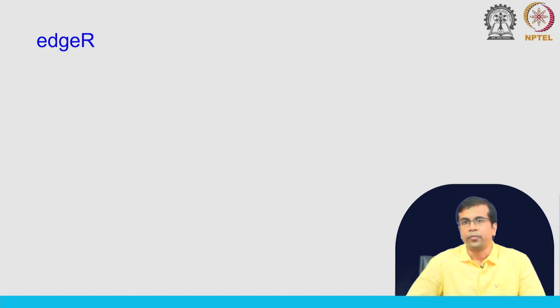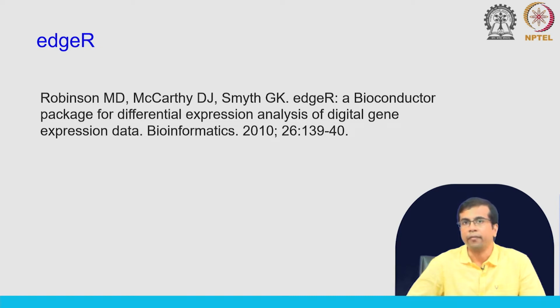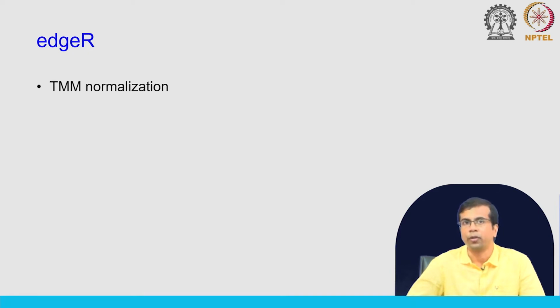So, I will very briefly mention the other tool, which is the edgeR tool. Here is the reference, and this is also a Bioconductor package. Again, this is a very popular tool for differential gene expression analysis.